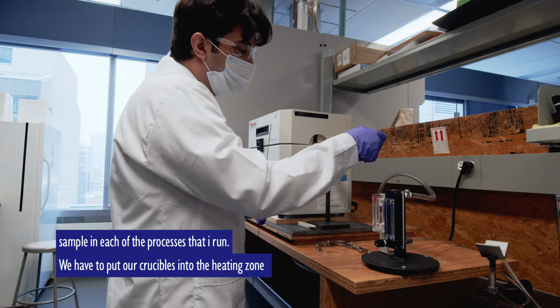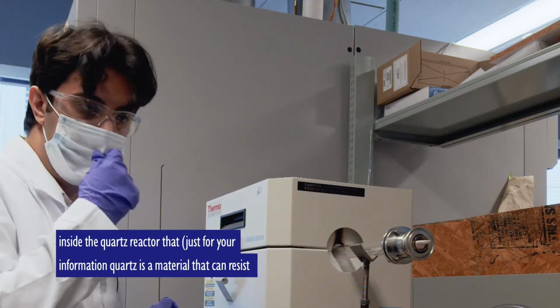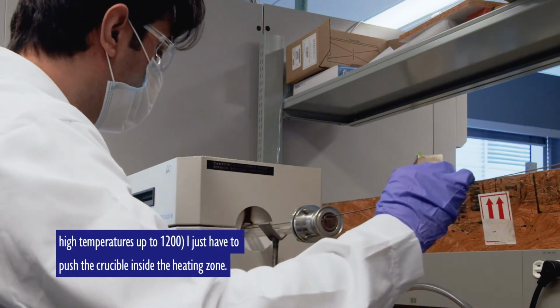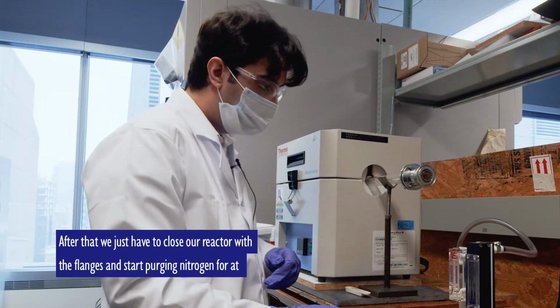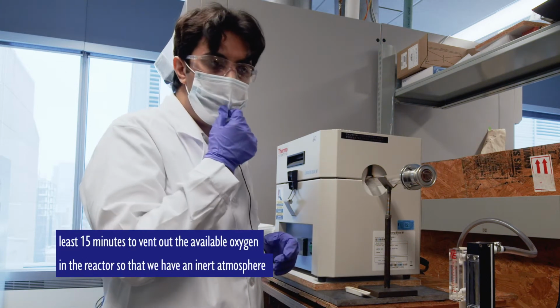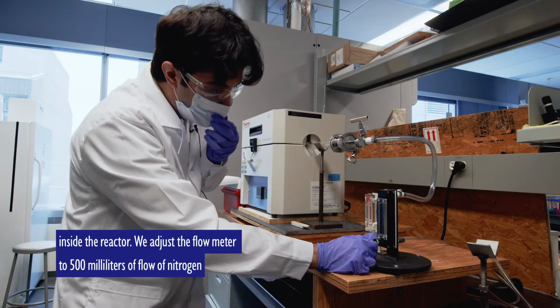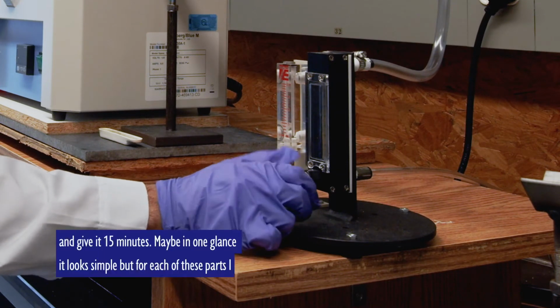So we have to put our crucibles inside our heating zone, inside the quartz reactor. Just for your information, quartz is a material that can resist high temperatures up to 1200. I just have to push the crucible inside the heating zone. After that, we just have to close our reactor with the flanges and start purging nitrogen for at least 15 minutes to vent out the available oxygen in the reactor, so we have an inert atmosphere inside the reactor. So we adjust the flow meter on 500 milliliters of flow of nitrogen and give it 15 minutes.